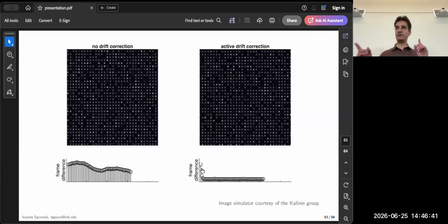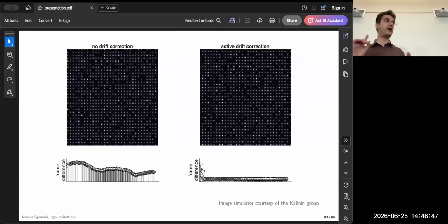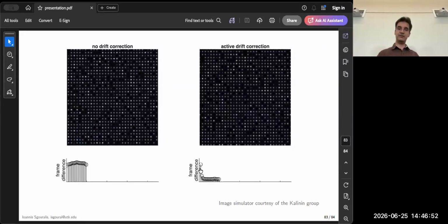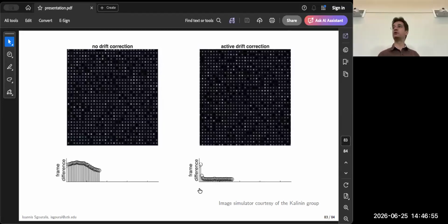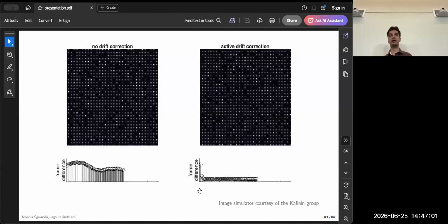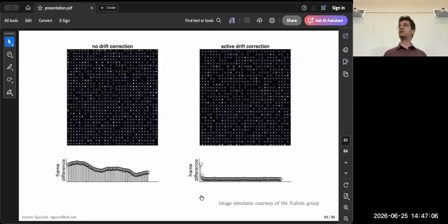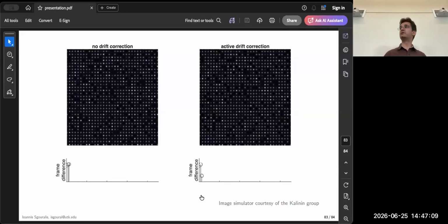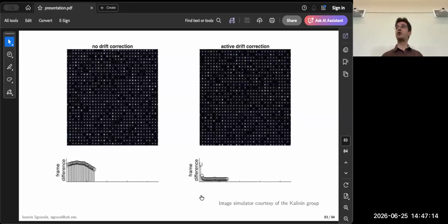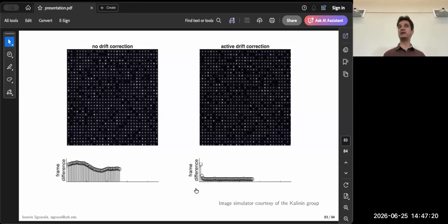There are also some nice features that we can look at in the time trace right here. Remember that the first two corrections need to be decided passively, which means the first two frames are basically uncorrected. As you can see, the difference between the two frames is actually quite high. That makes sense. However, the third frame in the experiment is acquired under a correction. Because it is acquired under a correction, the second difference is much lower. However, with just 3 frames, we have just one observation to use in the model, so our parameters are not learned very accurately, and that's why we have significant error.